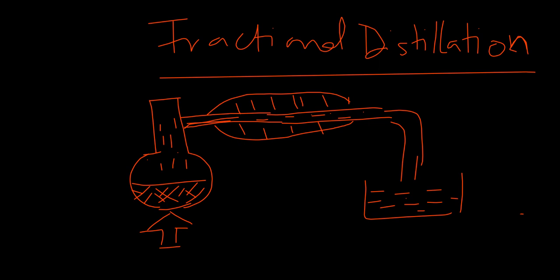Why? Because petrol, kerosene and diesel have different boiling points. So they will all start boiling and vaporizing at different temperatures. By the time one is done and is captured, that's when the other would also begin vaporizing and that would also be captured. When you are done with that one, then the next one would also vaporize and you capture. That's as simple as that.